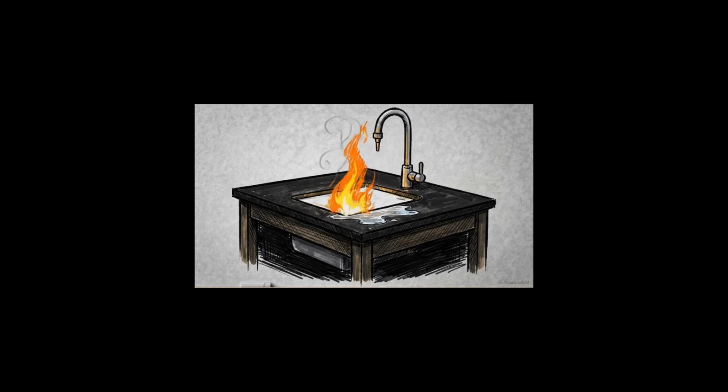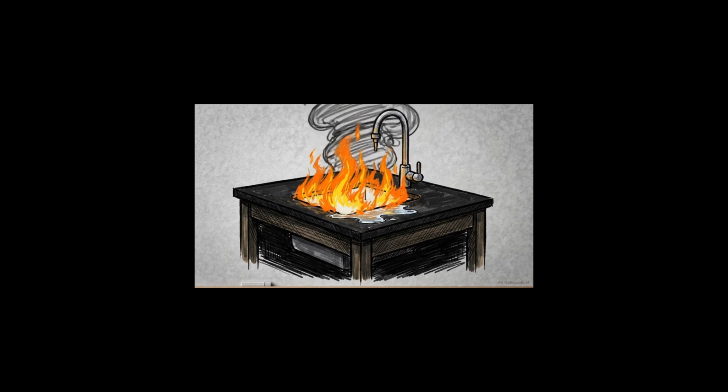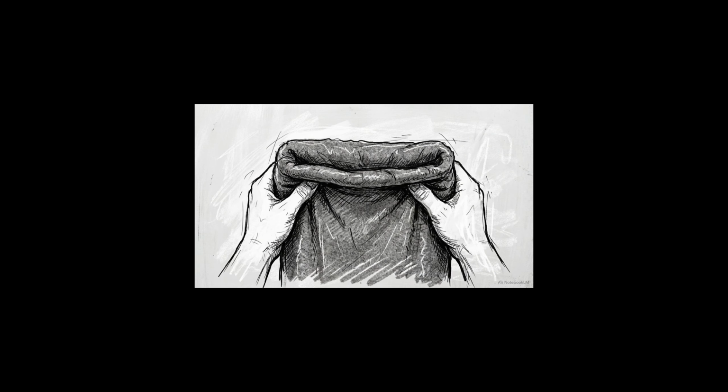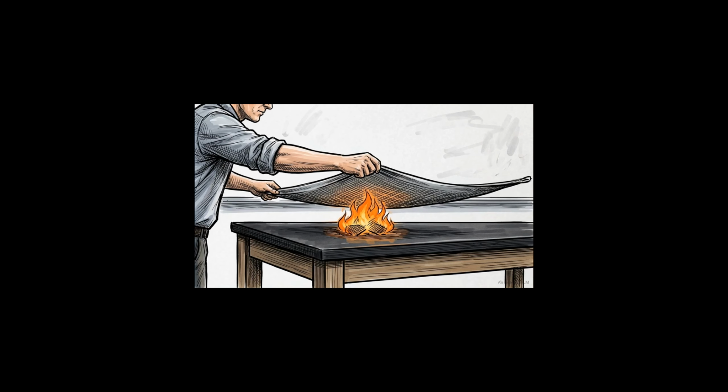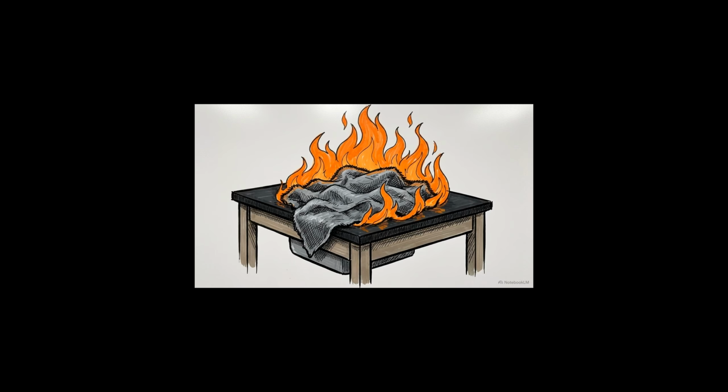Now let's address an escalating complication. The spilled chemical has reacted with the bench surface, igniting a secondary fire. You need to transition immediately to the fire blanket. Step 1 is safely pulling it down from its designated wall mount. Before approaching the flame, wrap the top edge of the heavy fabric over your hands. This grip shields your own skin from the extreme heat as you move in. You must lay the blanket down using a smooth, controlled smothering motion. If you panic and wildly throw the blanket at the bench, you commit misfeasance, an improper act that can fan the flames and increase your liability.